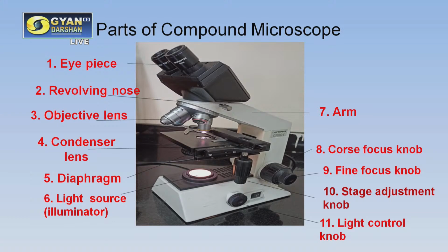How much light enters the objective lens is decided by the condenser lens, the diaphragm and the light source. The light source is basically a halogen lamp or tungsten lamp. It is an artificial source of light which illuminates up to the diaphragm, condenser, objective lens and revolving nosepiece.